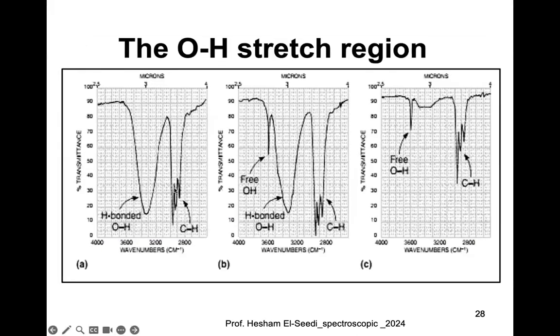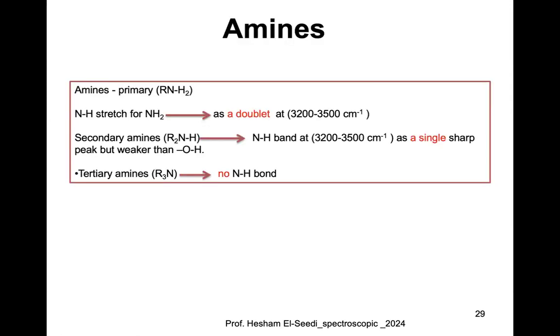What about OH stretching? This you can see here, the hydrogen bonded. Here is the free OH. So the hydrogen bonded OH is broad. Free OH is sharp. This is free OH again. Now it is clear for you, I hope.